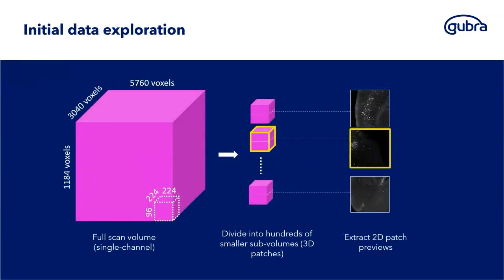So, referring these dots in the app back to the actual images they represent, the 2D images that were embedded again corresponded back to a subvolume, and it's these subvolumes that we now want to annotate. And again, in this case, we now need to annotate 20 subvolumes, each having the size of 224 by 224 times 96 images. This in 3D will take a long time to do manually. So as I alluded to, we will present a method for semi-automatic annotation of these.